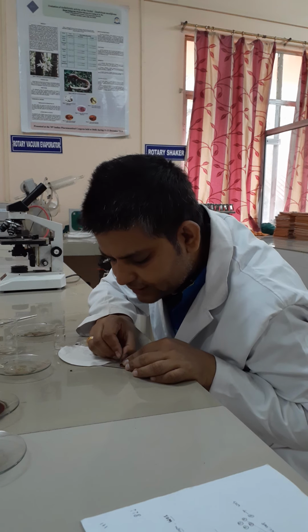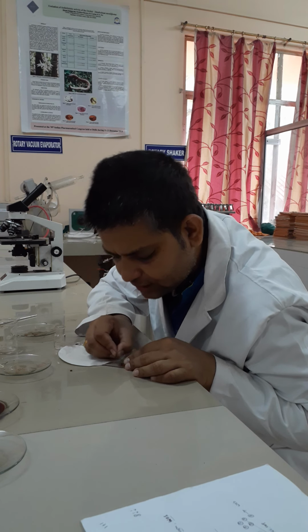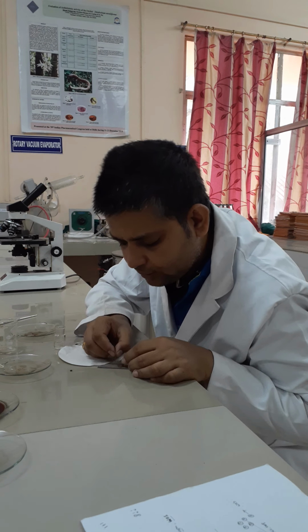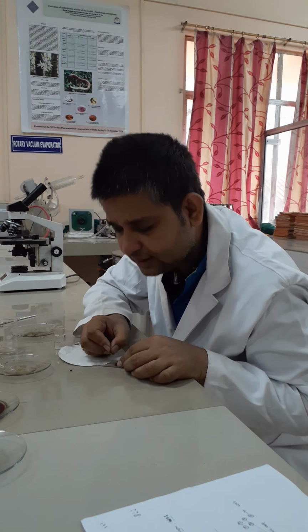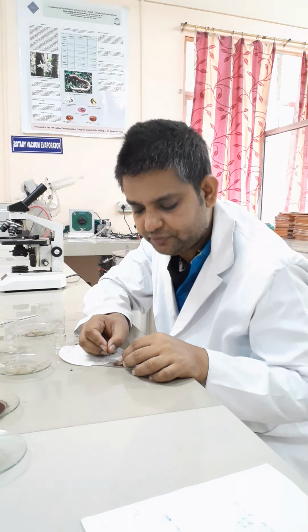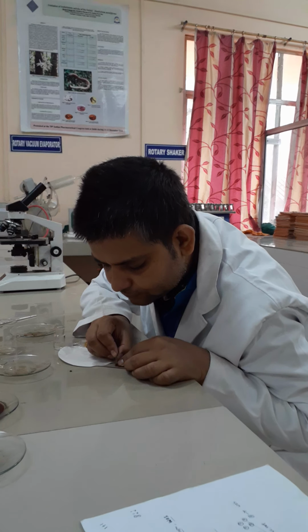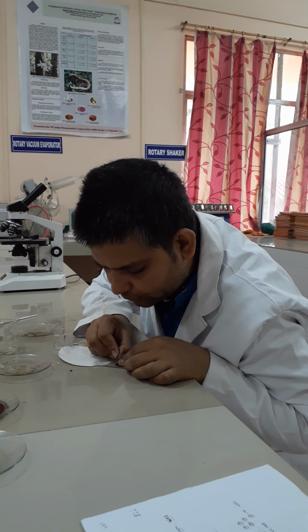Remember, new blades are very much essential for taking a sharp thin transverse section, as it is very hard. Otherwise the section will become thick, and in a thick section you can't observe the cellular characters very specifically. Like that, I am taking a few more transverse sections.